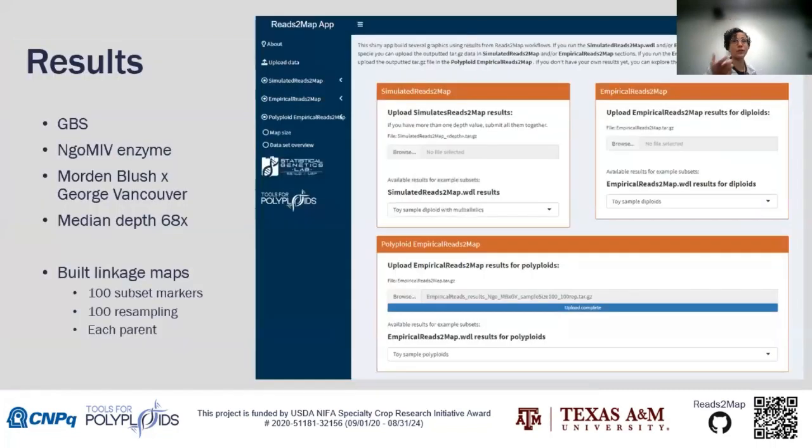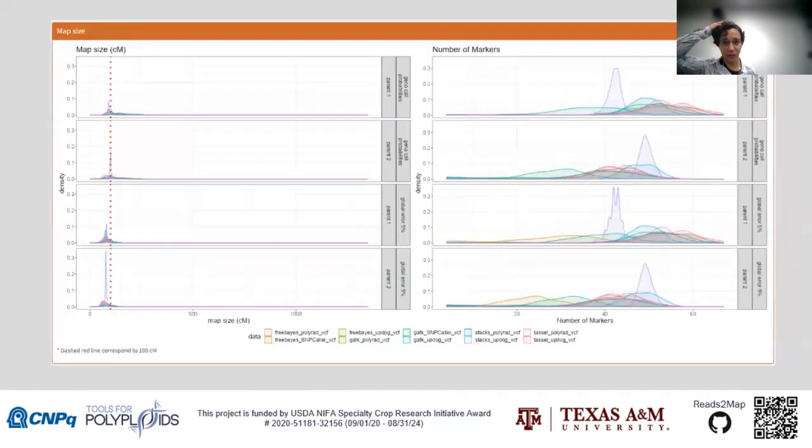And just to see if it would change, we've seen same species and same person doing the GBS and just changing the depth. We ran with another data set of roses, and we figured out that we didn't need to run 500. This time, we ran only 100. And then we had this big peak of stacks and updog. And then I thought, oh, maybe sometimes stacks and updog is good.